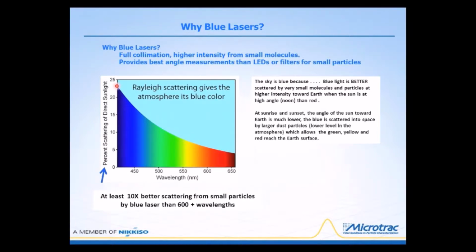But this is the reason why our sky is blue. Those small molecules and small dust particles in the atmosphere scatter the light very well compared to the reds that are in the visible spectrum. Thus, during the daylight, the high scattering from the small particles preferentially scattered the blue region of the sunlight very strongly compared to the other colors.